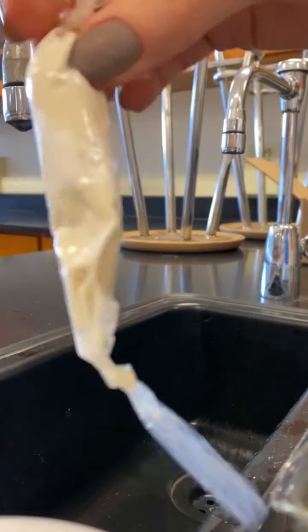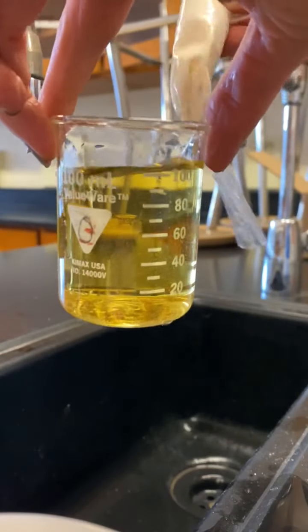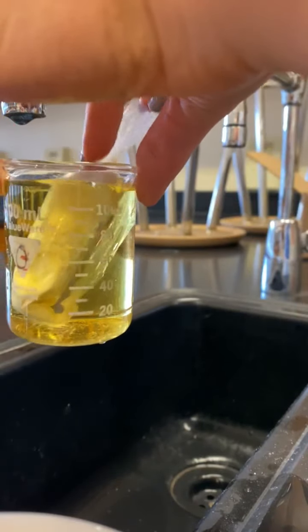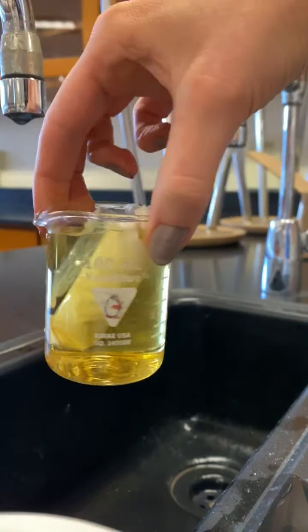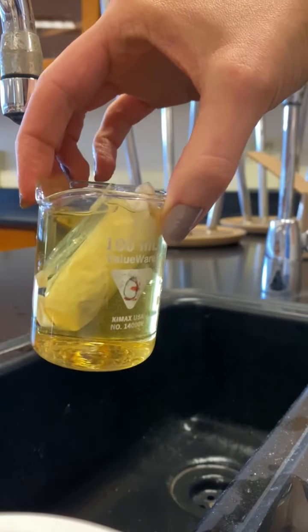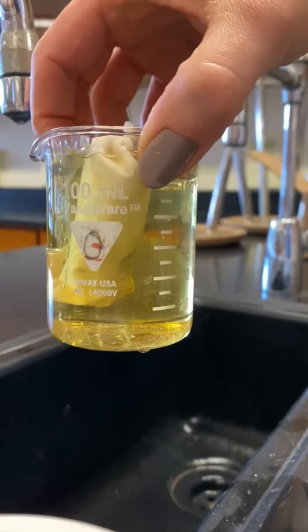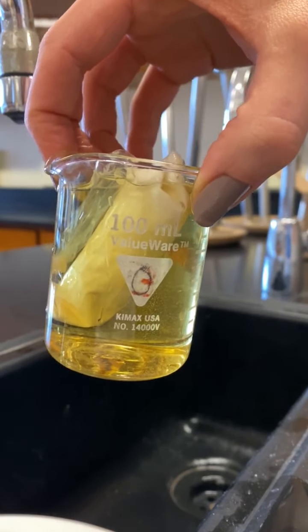Now we're going to take our dialysis tubing full of flour and submerge it into this beaker of water. The displacement of water is going to make it overflow, but that's fine — I just want to make sure it's nice and covered. I'm going to leave this bag with the flour inside the dialysis tubing for about 15 minutes, although sometimes the results can be faster depending on how much iodine I used.